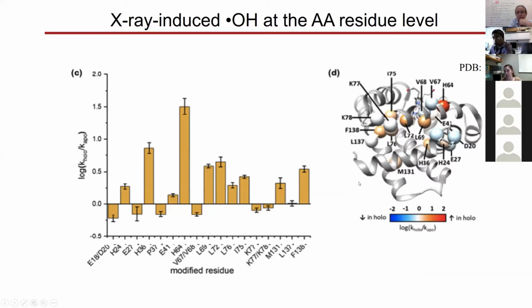So we put this information on a structure again, in the same manner as I already described to you. We see that some area adjacent to the heme binding site also shows an increase of labeling, but you can notice that we don't see this helix labeled at all in the hydroxy radical experiment, which is actually implicated in binding to the heme. So if we only did the hydroxy radical experiment, we would lose this information completely. We would not even collect information for this region.